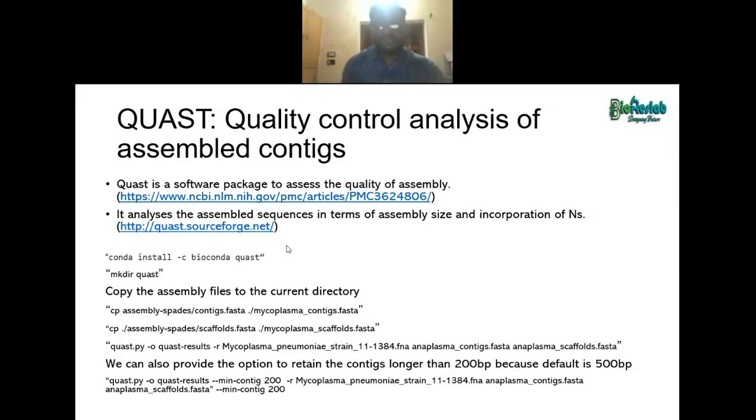It will tell you how much length we have received for each of the sequences, and if you want to compare, we will also get comparative data on which assembly is good. Suppose you use various different assemblers, then you can employ the Quast tool for the assessment of the assembled sequences quality. You can install Quast using conda install -c bioconda quast inside Anaconda.